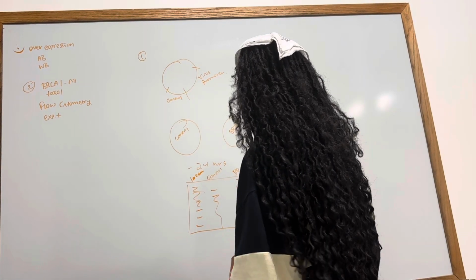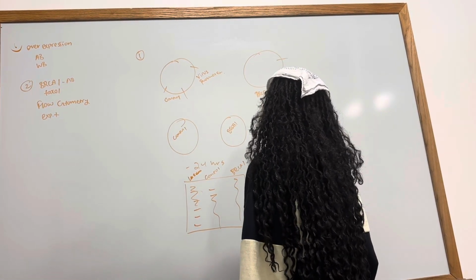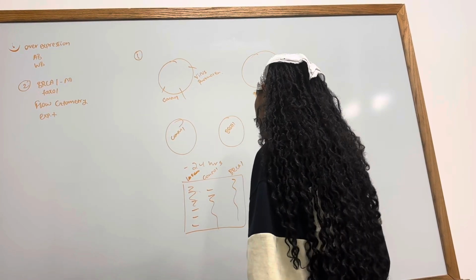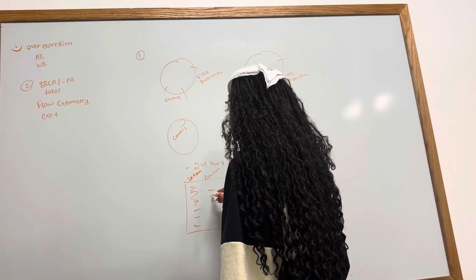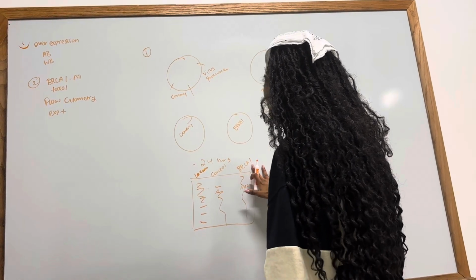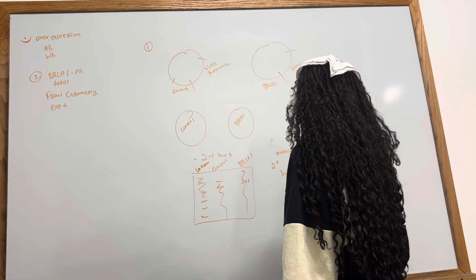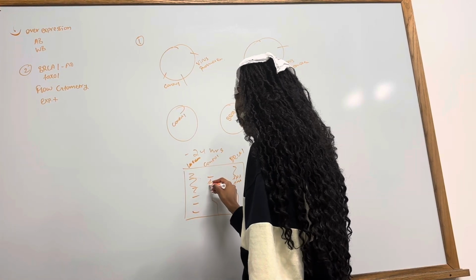We're gonna add antibodies. So what antibody are we adding? Let's just say for the primary antibody, we can do mouse anti-BRCA1. And we're gonna add a lot more in the BRCA1 sample compared to the control one, because we expect a lot of BRCA1 in the BRCA1 overexpression. And then we're gonna add our secondary antibody. We can call that horse anti-mouse. So this will help us see it better.